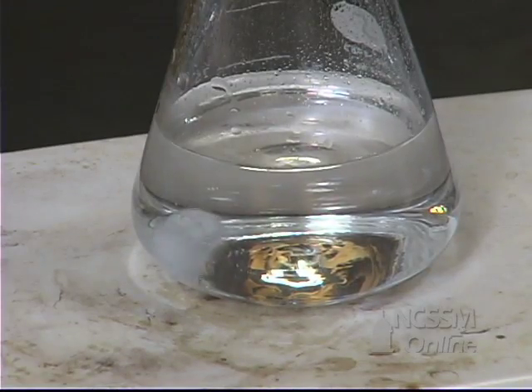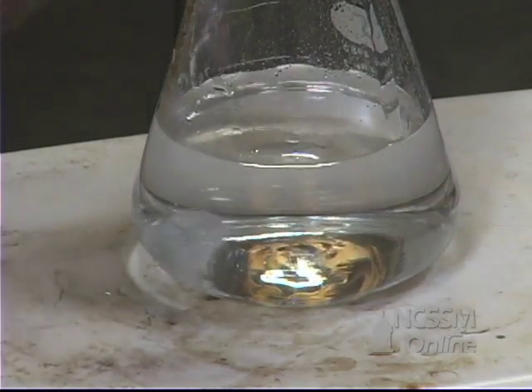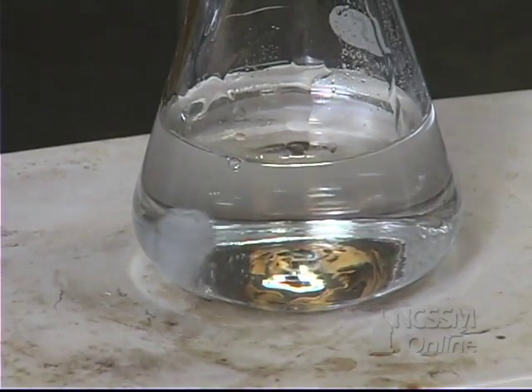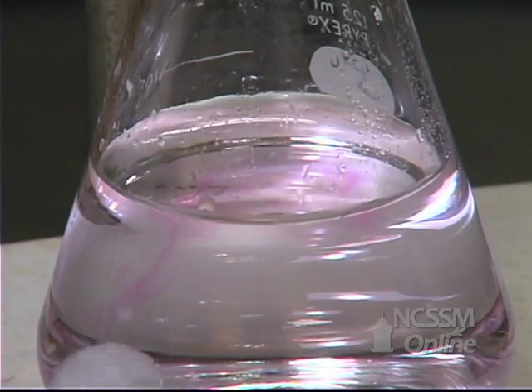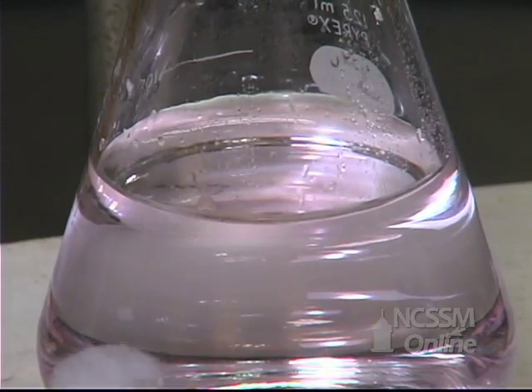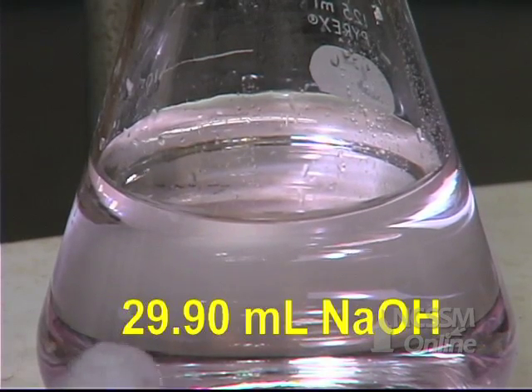We're close to the endpoint. We're going to rinse down the walls of the flask to make sure that anything splattered on the walls has a chance to react. When we reach the pink endpoint, we know that we've added the same number of moles of sodium hydroxide as there was excess HCl. The solution has now turned pale pink. We'll take a final burette reading.